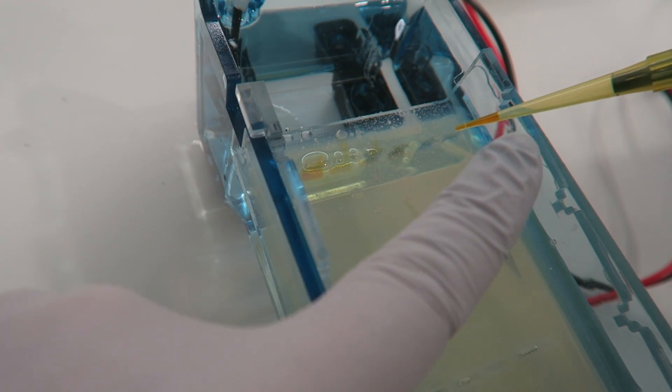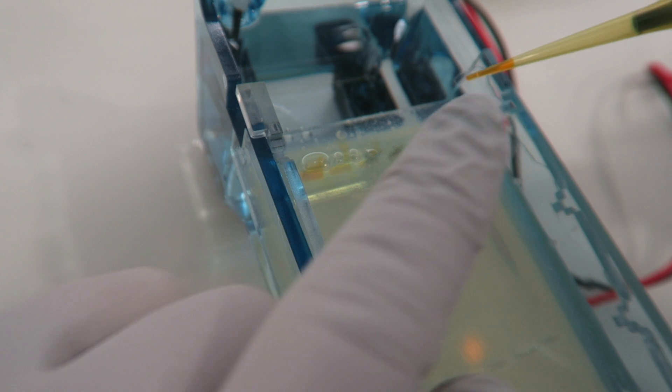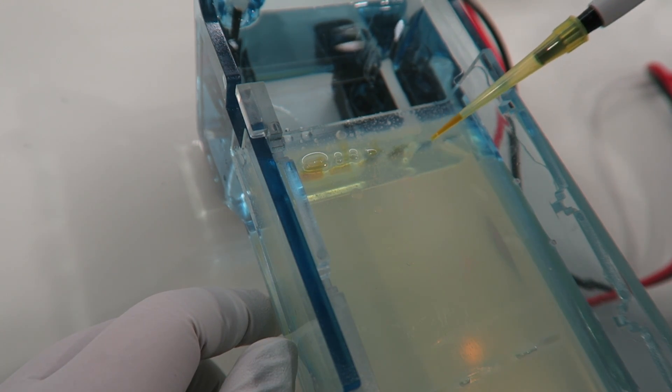The gel can then be visualized under UV, radioactive hybridization, or with a fluorescent probe to see where the bands are. This can then have a photo taken and be used for diagnosis.